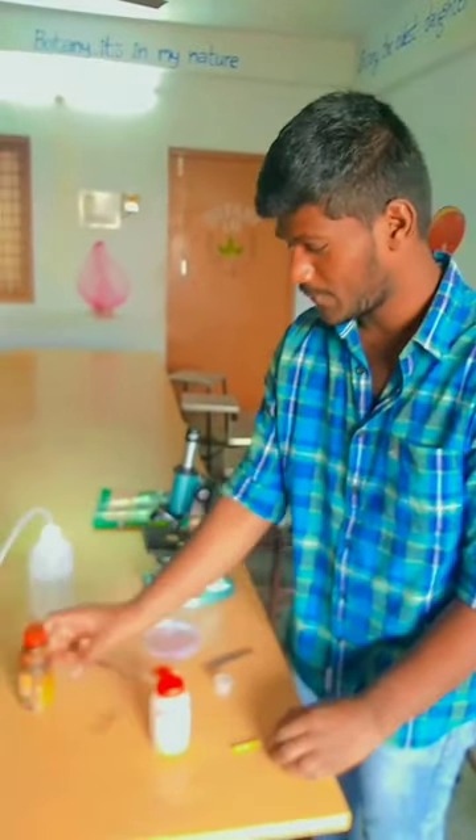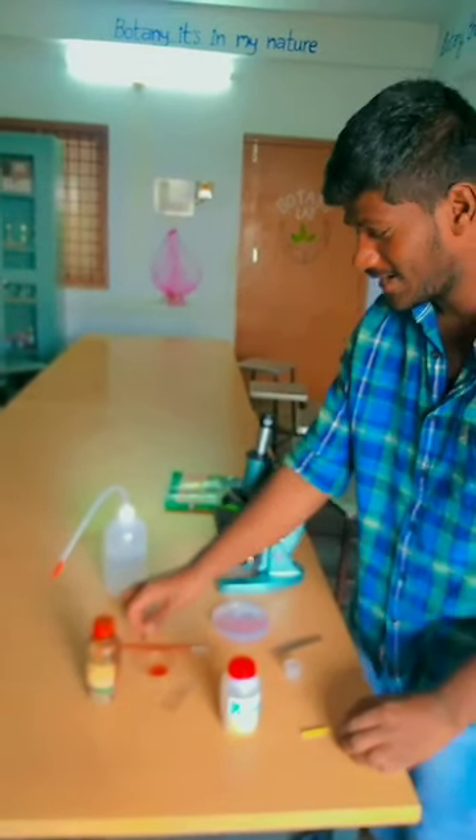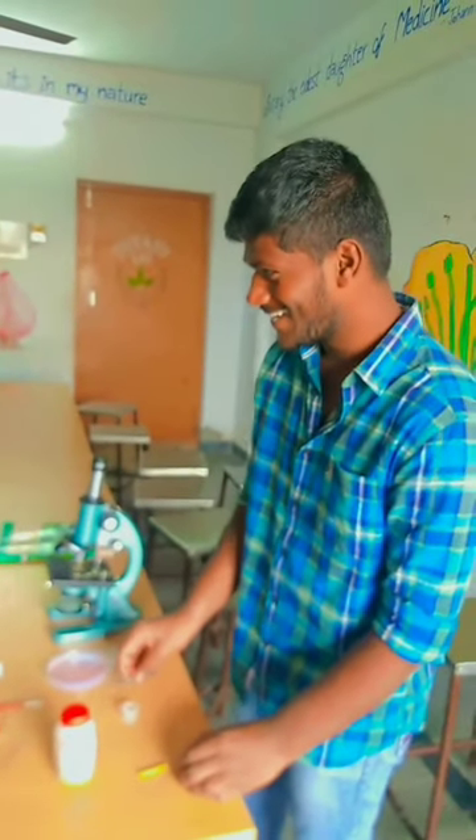The materials required are: a slide, methyl orange, glass, brush, blade, water flask, and forceps.